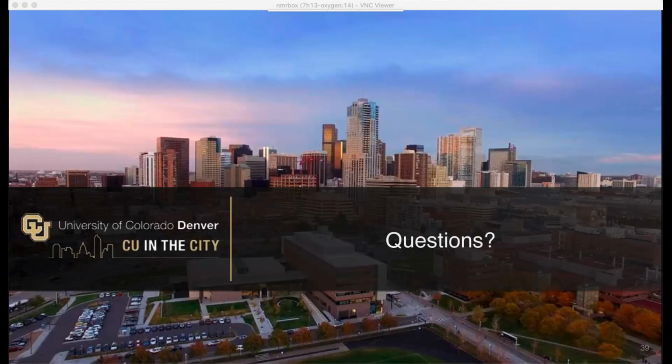And so software-wise, it's going to be in parallel at this point, because new modern systems will allow you to run POKY, because POKY has all the modern features. But the servers at NMRFAM will not be able to run POKY unless they upgrade the operating system. So I also consider that. I'm actually an external collaborator of NMRFAM. So my contribution will partly go towards NMRFAM-SPARKY for maintenance and a few new developments. So that's our plan.